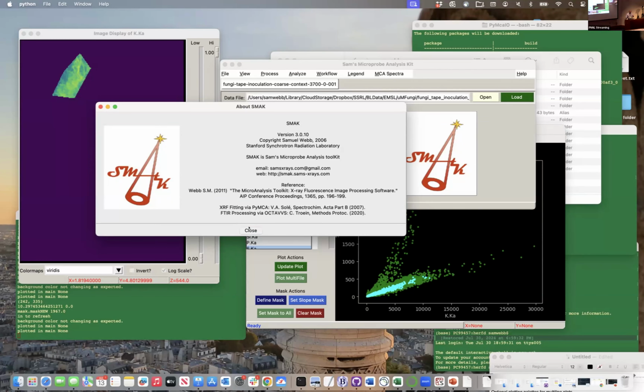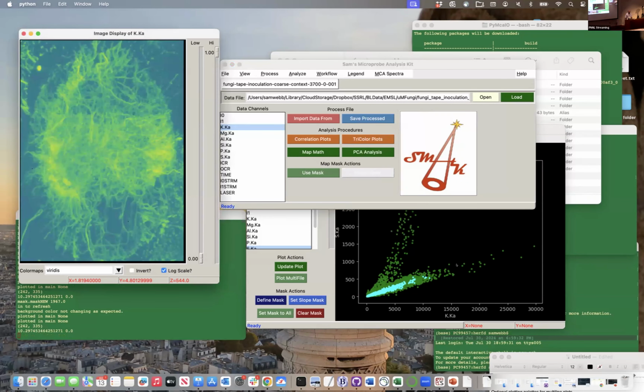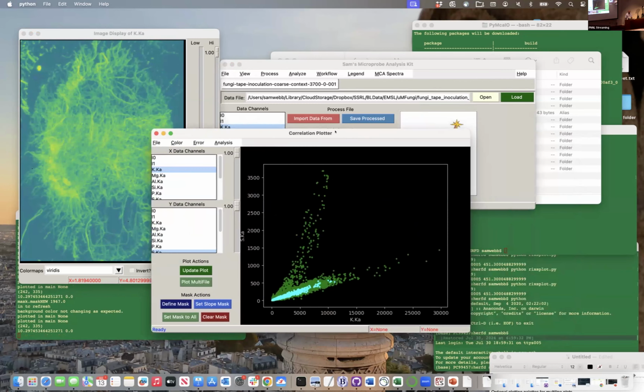Citing is always friendly. So let's see. So there we go. So correlations. I always like to just show that briefly.